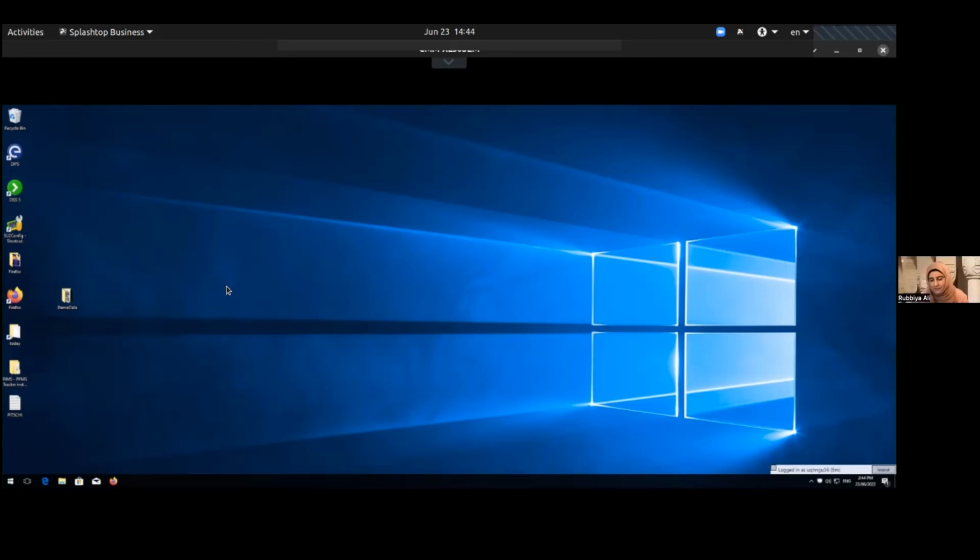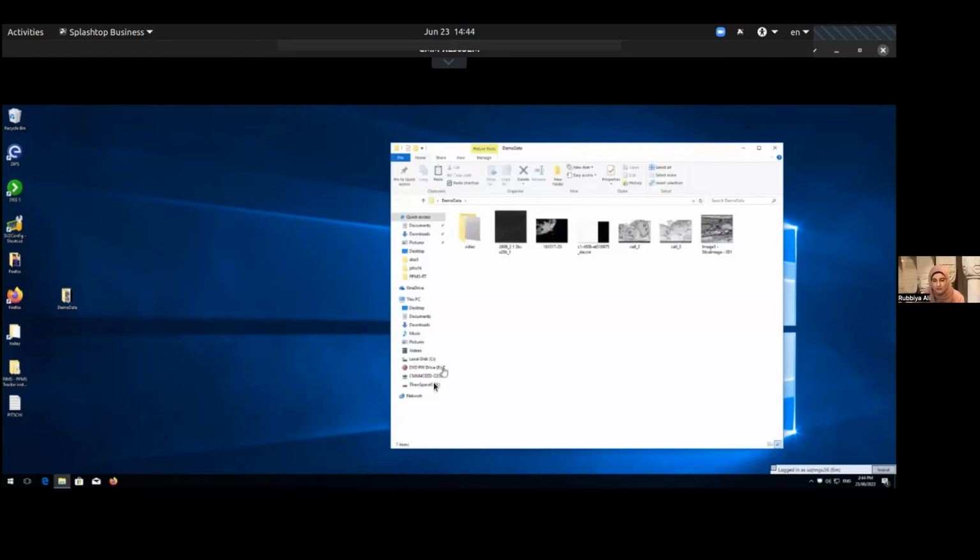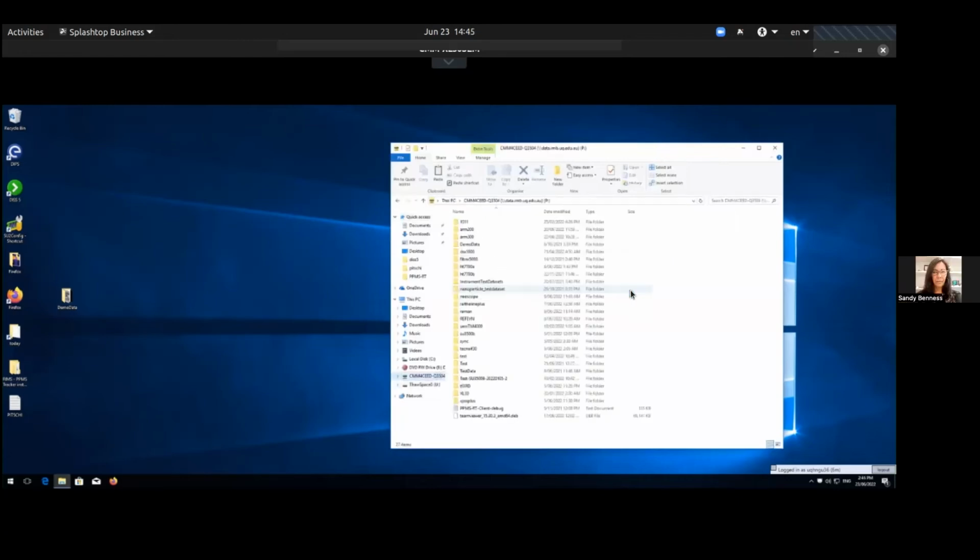There are multiple settings of this tracker. You can charge just for the booked session, or for the usage, or you can adjust both of them. At the moment for us, we are adjusting both the usage and the booked sessions.